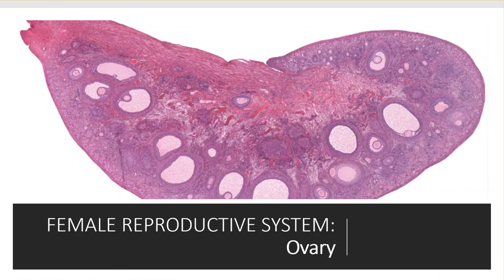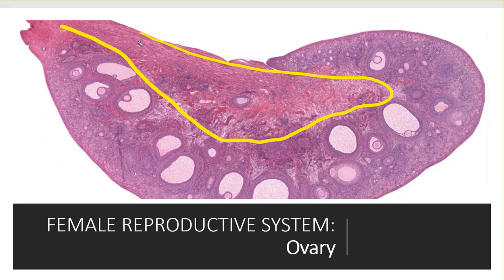So here's our ovary. It's really cool. Ovary has a cortex and a medulla. And so this middle area right here is pretty much the medulla, and you'd see the ovarian ligament coming in to anchor it. So there's a bunch of connective tissue in there. And then there's going to be a bunch of arteries and veins hanging out in there where the blood supply comes from.